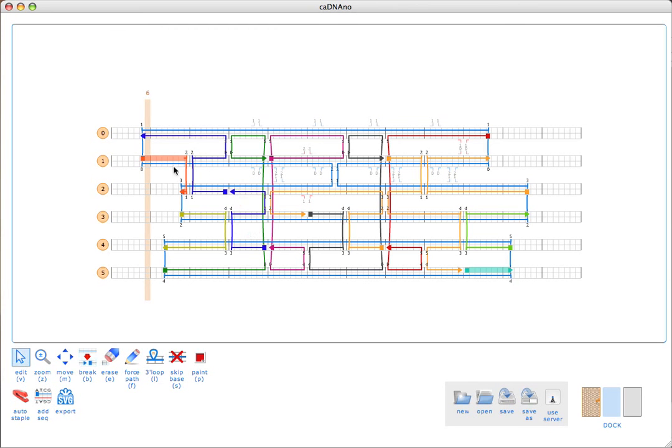Well, we'll put a break there. And I still have this strand, which is highlighted because it's too short. And there's really nowhere for us to go, so I might actually just remove these crossovers and then just combine those staples with other staples. And then we have one more down here, and now this guy's too long, so we'll just add a break right there.